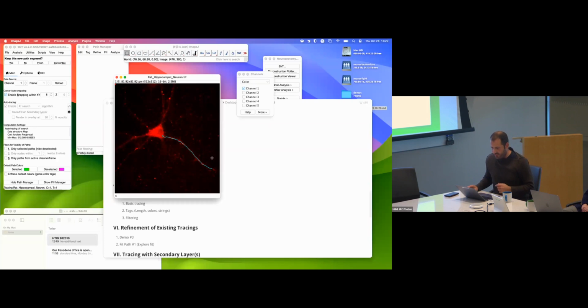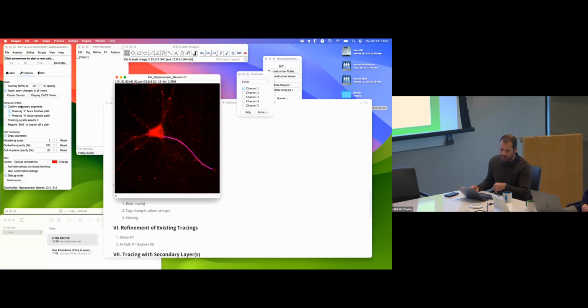Anyway, then there is this prompt here that is going to ask you all the stuff. It now knows that you did a segment, so it asks you, what do you want to do with the segment? And you see that the shortcuts, the letters that are highlighted, are single-key shortcuts. If I want to keep it, I just press Y for yes. If I want to finish, I press F, and then it's done. If these are too annoying to you, you can just remove all these options, and then when you are done, it just finishes.